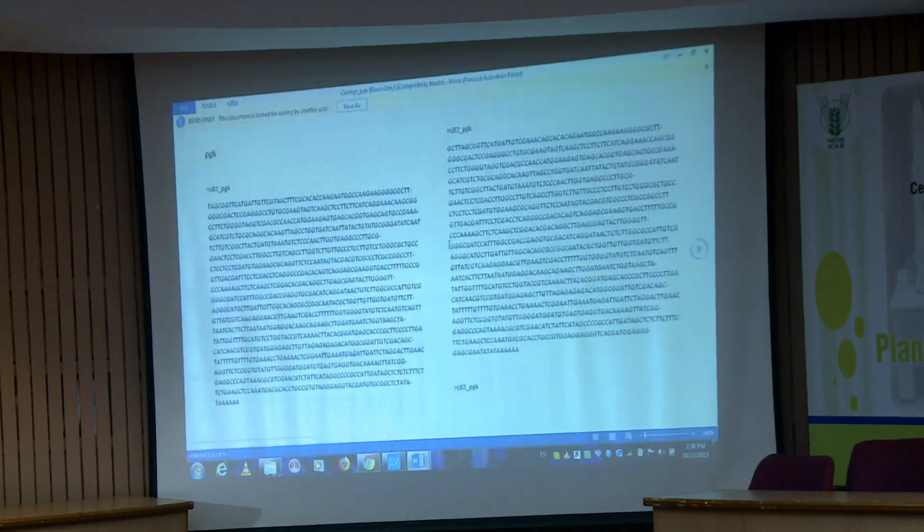Okay, meanwhile it will get, okay. Let's suppose I'll take this one sequence.